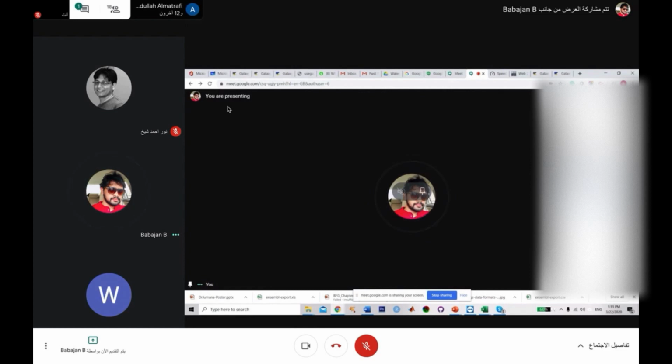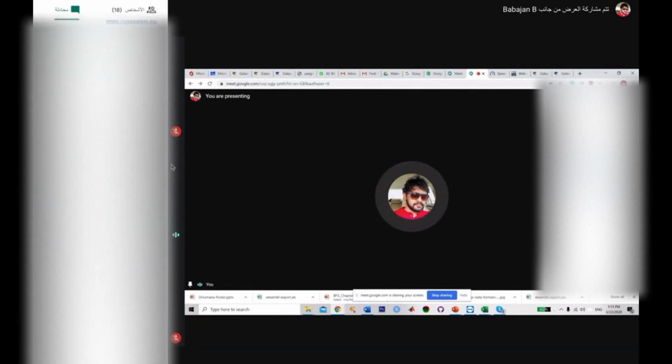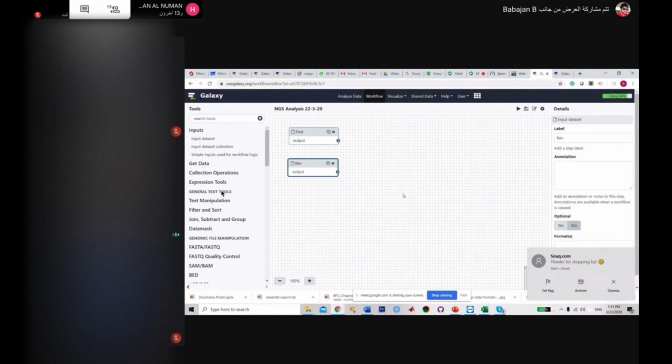Anyone? What is the next step? Once we receive, no, not Sambam. Okay, so first we need to check the quality. Yeah, that QC. So we need to check the QC. Yes, we need to check the quality of our sample, how much they are, how accurate they are. So the next step is to check the quality.